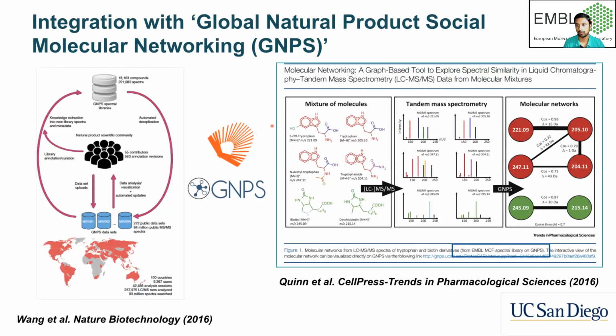There is one more repository where our library is available, which is GNPS. I'm particularly mentioning GNPS since this is a botany seminar, and it is the Global Natural Products Social molecular networking platform, a tool for data analysis that also has a good collection of metabolites from plants and various other natural resources.